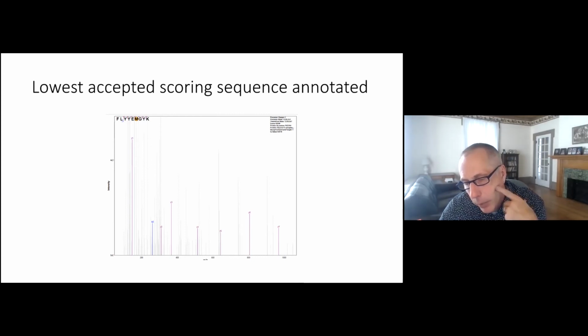Okay. So let's say that we had a case where we think that there were 4 things isolated. Then we make 4 copies of the MS2 spectrum, each with one of those 4 parent masses. And then we are going to select peptides from the Target and Decoy database that have those theoretical masses. And then we're going to report the best match for that combination of parent mass and MS2 spectrum. But the parent mass is going to be slightly different for all 4 of those things, so we're going to be selecting different subsets of Target and Decoy peptides whose masses match that parent mass. Does that make sense, Colin?